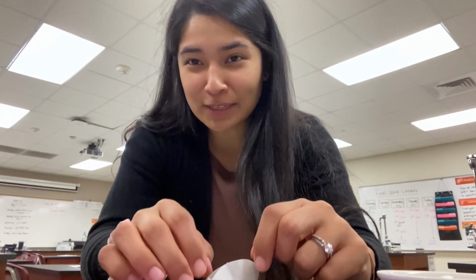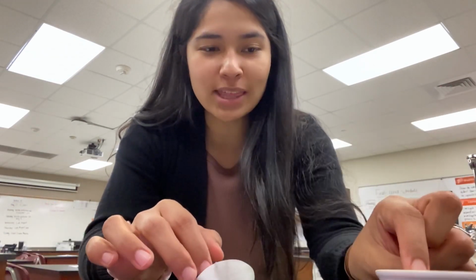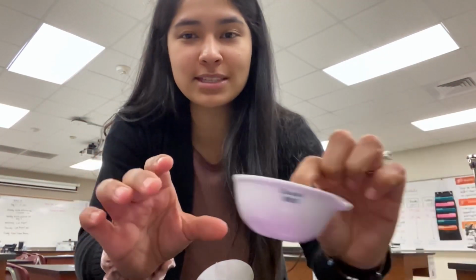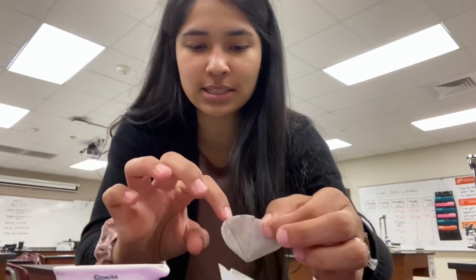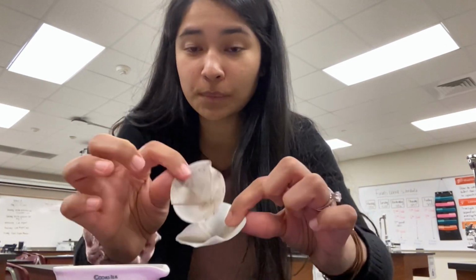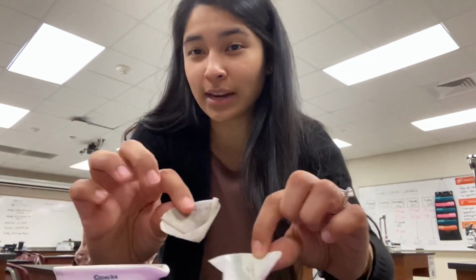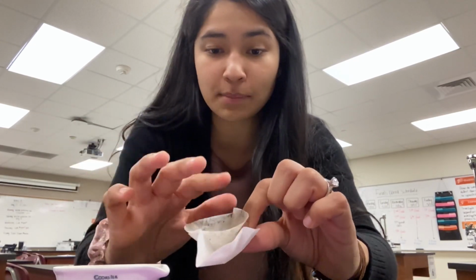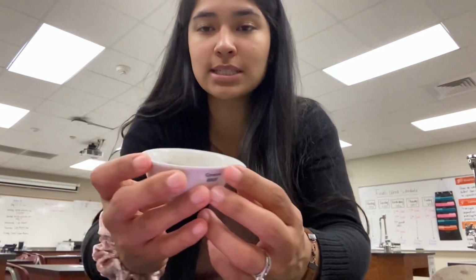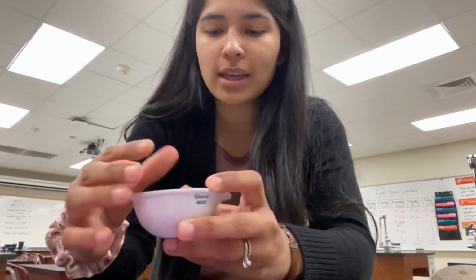Okay guys, so after like 20 minutes of waiting on this filtration to take place, we ended up with our two last separations, right? So we have the sand, and whenever I collected the sand, this is what the filter ended up looking like. I had to do two, one for the original filtration and then a second one just to make sure that all the smaller particles were actually trapped and weren't able to go through. So our resulting sand looks like this, pretty wet, right? Very chunky, so this one's easy.